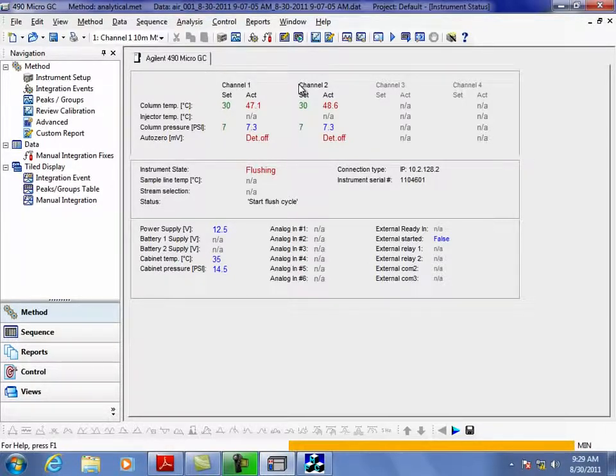But you're going to have a valve, and you're going to have another valve, because you're going to have to isolate the two. And the one valve going into it from the sample that needs to be pulled or has pressure on it, the standard system, has to be very, very close to where that T is, because otherwise part of that sample will always be there even when you're injecting and trying to go past it.